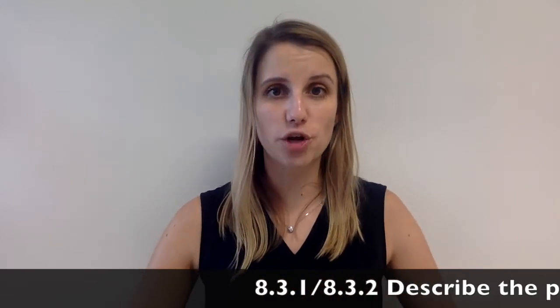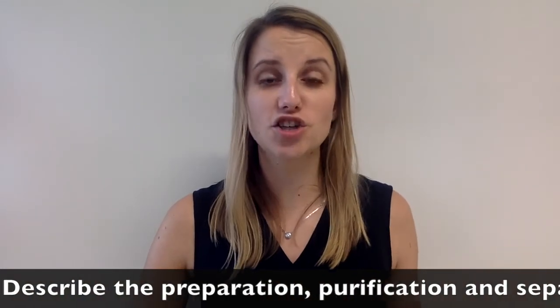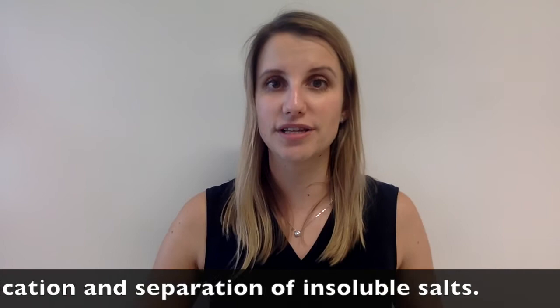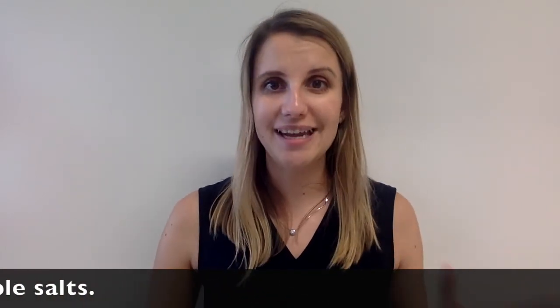Right, that's all there is for this video about how to make insoluble salts. The key difference between this and making a soluble salt is that there's definitely no heating involved in this method. So if you're making something insoluble, you never need to heat it.